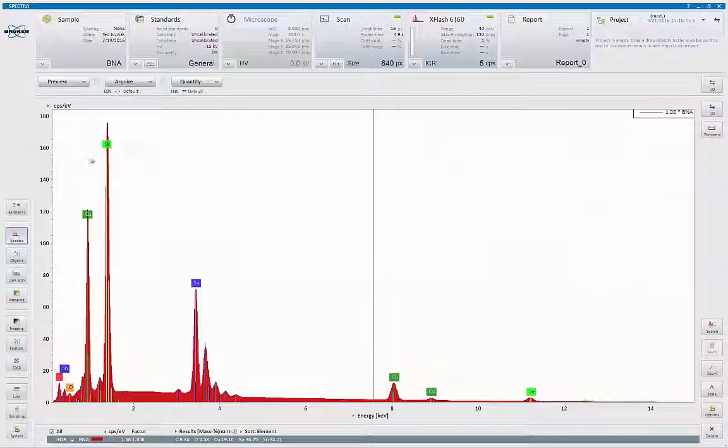Upon starting the software, you have the workspace list here, which are your various operations and controls. And on top, you have your configuration bar, which allows you to set defaults for both the software and the hardware for the analyst.